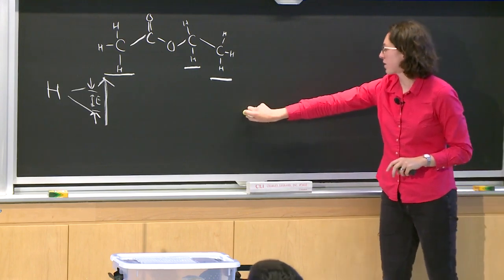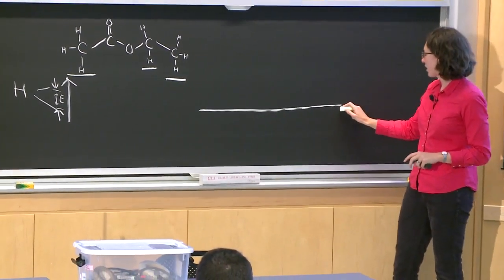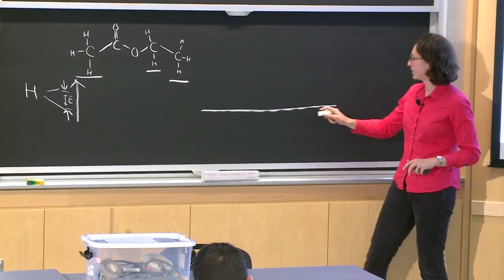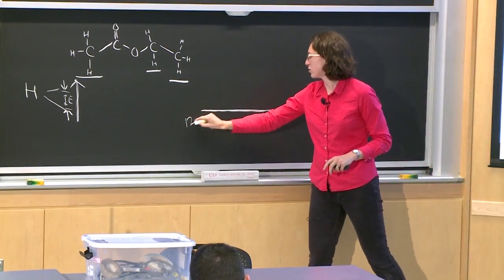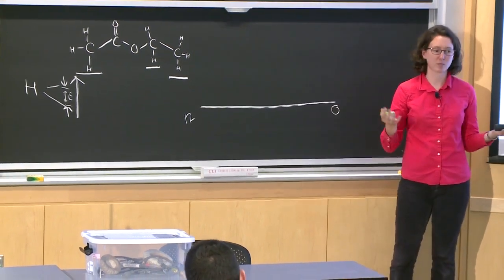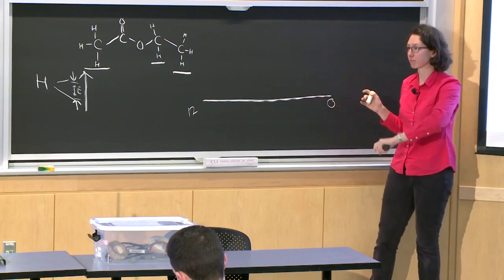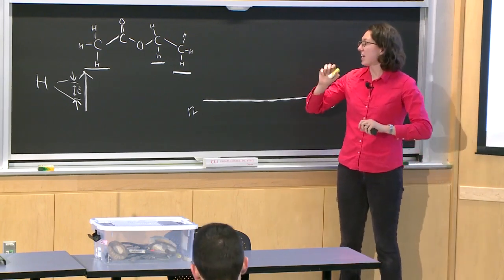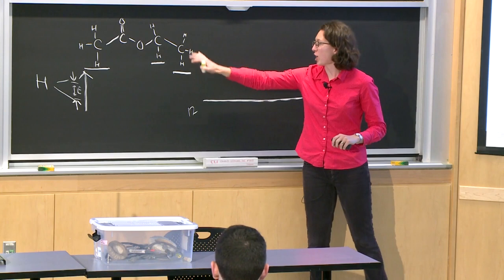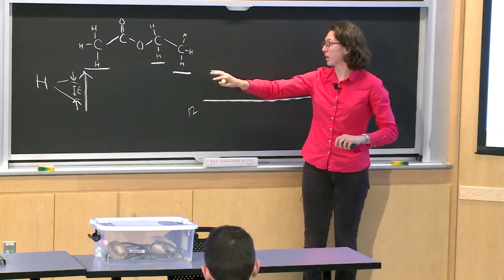So the way that an NMR spectrum is laid out, it's on a scale of 0 to 12, give or take. It can go beyond that, but for the purposes of most organic molecules, all of the peaks will be found in this region. And the location that a proton peak appears is again related to its chemical environment.